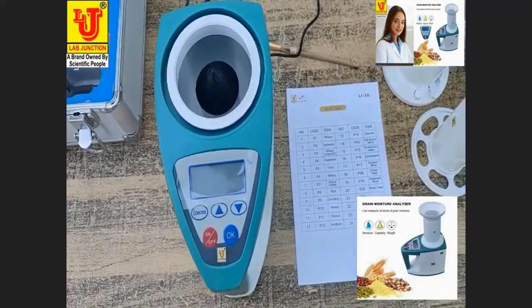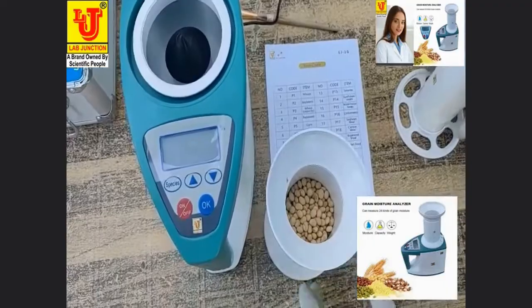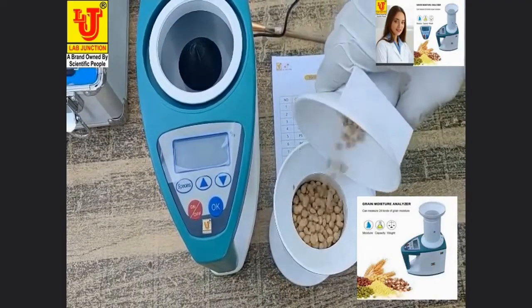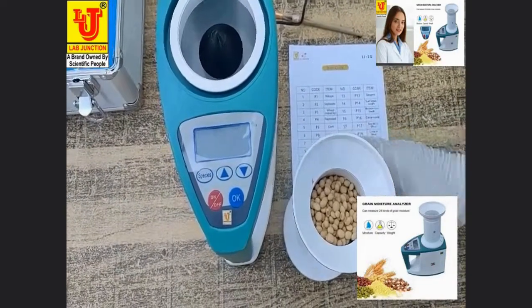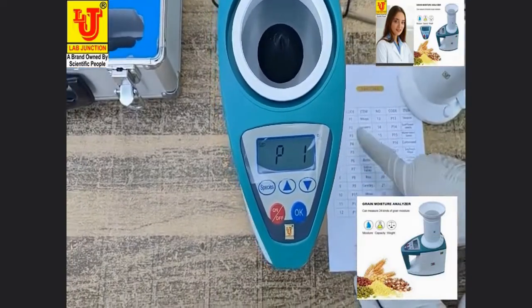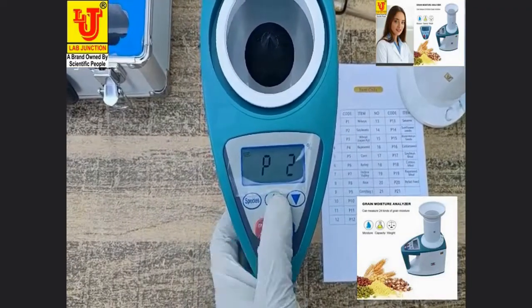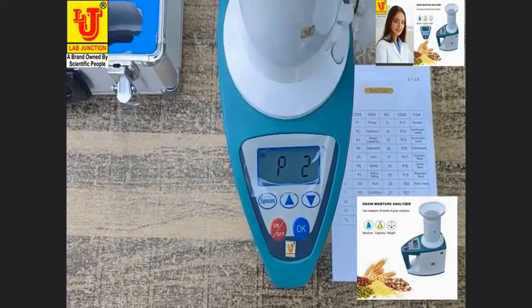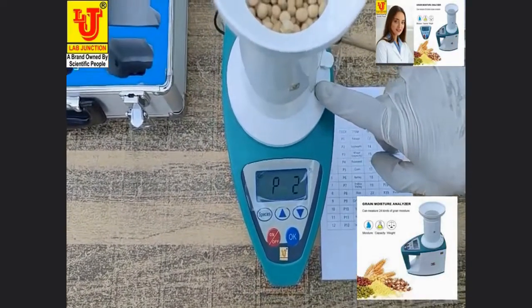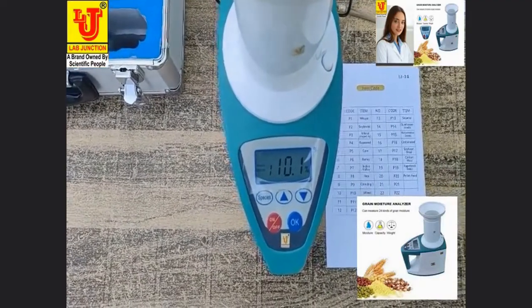Now I am measuring soya bean moisture. Switching on the instrument. Soya bean code is P2 — selecting P2. Pressing the key. Directly, the moisture of soya bean comes: 10.1%.